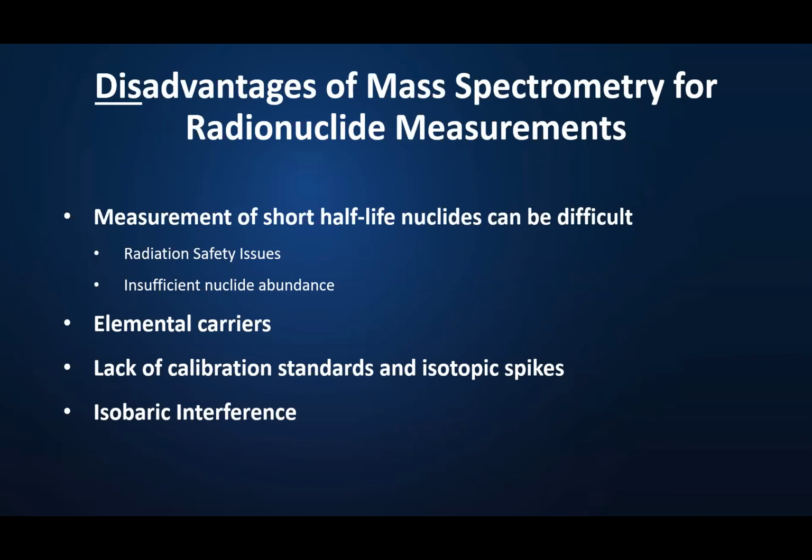No, it's again. I was just contemplating the calibration and standards issue. Maybe it's an opportunity to think about potential collaboration and cross-fertilization of these two fields, because basically, on the chemistry side or the mass spectrometry side, if I want to be blunt, none of our measurements are absolute.